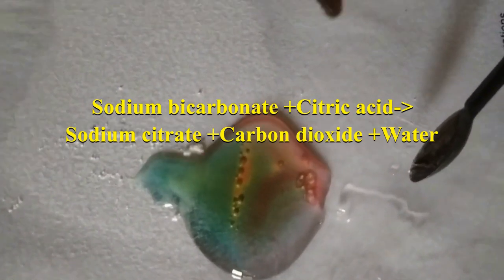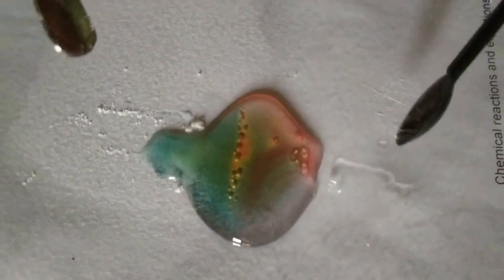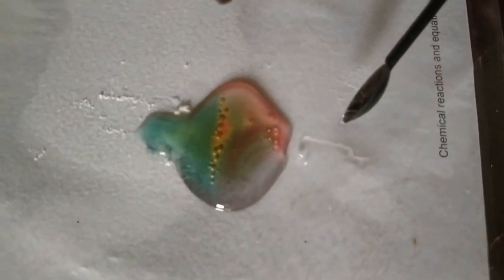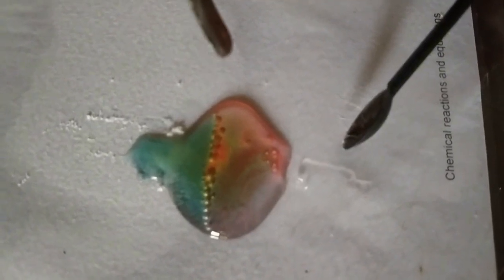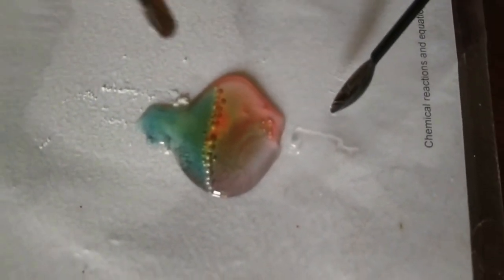Right? The color also is gradually changing. One side it is completely blue, another side it is red. After some time you will find different colors, shades of red. Red, orange, yellow, and this side blue, and finally green. Yellow means very light or very weak acid, and red means strong acid. Now we can see the bubbles at the center, right?